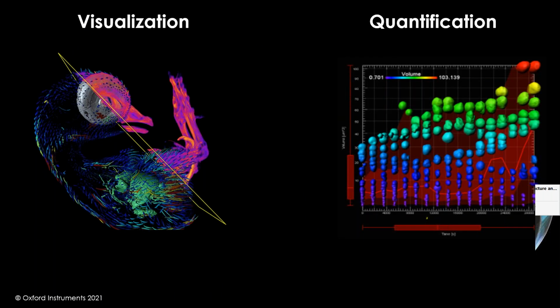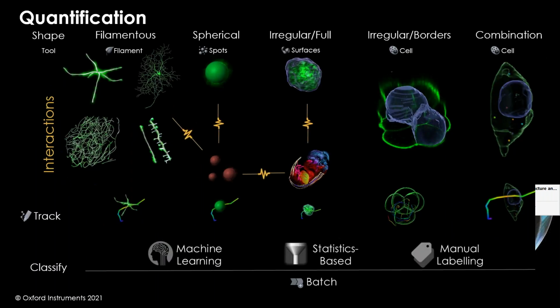We also perform quantification, and this is another place along with rendering where Imaris really shines. We have a few different models, and you can see those up here. I need to give credit to Georgia, one of our salespeople based in France, who created these first slides.